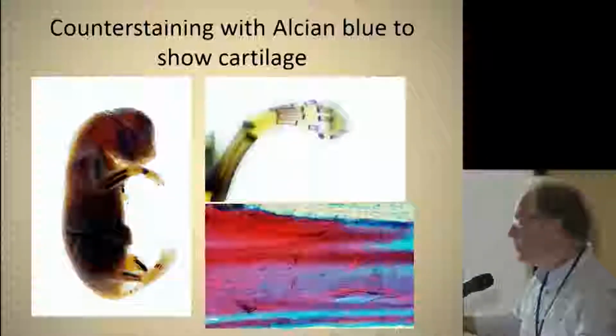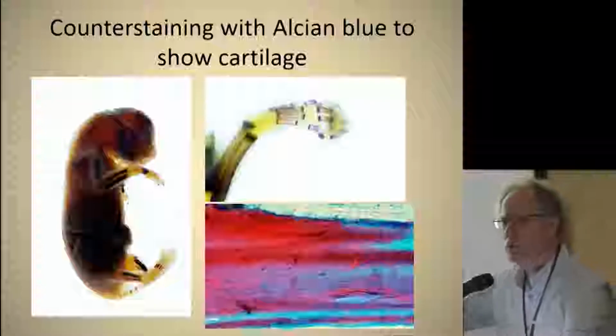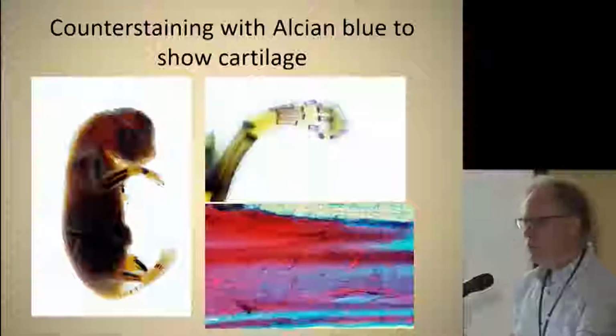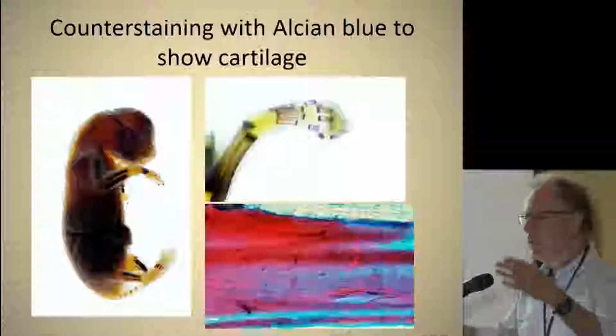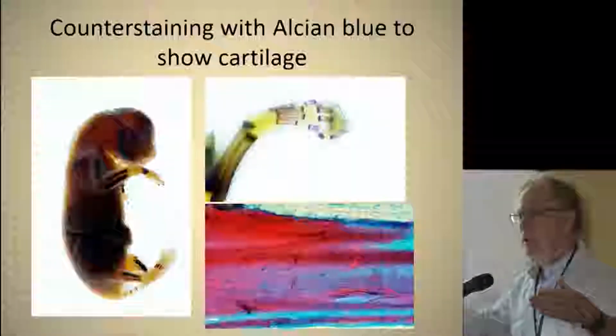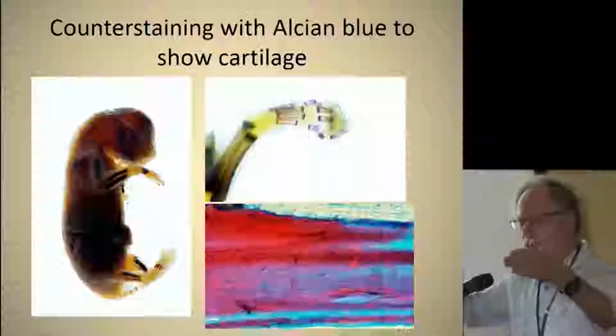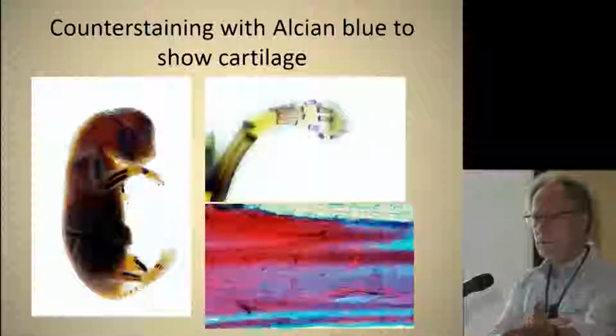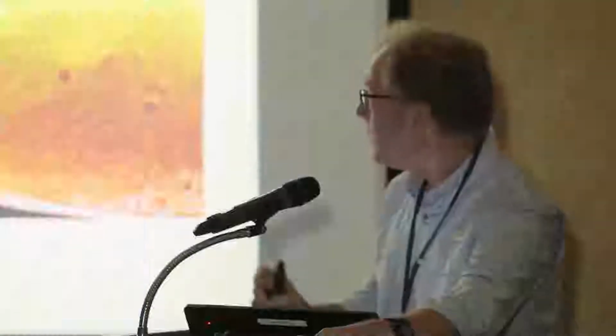And this is just a really good picture that I think, after the students have done the technique and they know what they're expecting and they get these results, they truly understand this process of chondrification and the developing of the endoskeleton and then progressive osteogenesis that results in basically just these long fused bones with cartilage only at the joints. So again, that's just all student imaging that you're seeing there.